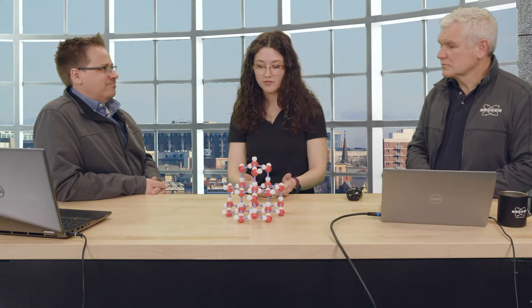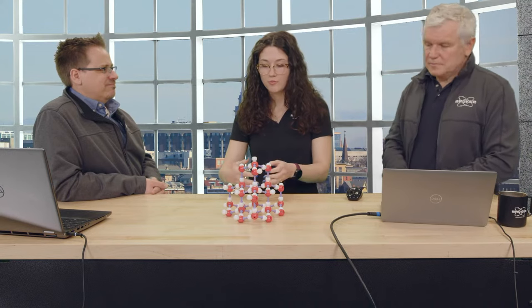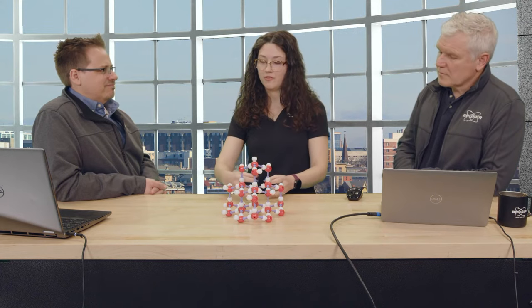So if I want to use the best system I can find, would it be better to use a duo system with those two radiations or to use, say, a metal jet? It depends on your materials. Most of the time, I would say a dual system is best. Only in very specific cases will you need the metal jet. Do you agree with that? Yeah. If you have proteins that just do not diffract to a high resolution, and you have long unit cells, you need gallium, you need a longer wavelength. But if you look at a uranium intermetallic that's modulated, you don't want to use copper or gallium, because you get too much absorption, and you really want to minimize other effects that can hurt your data quality.